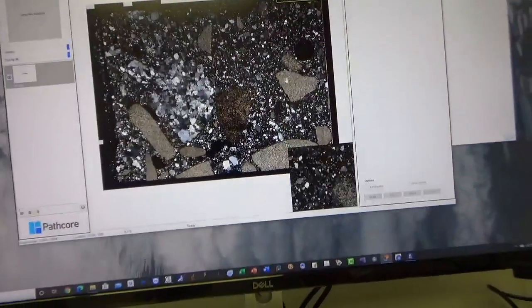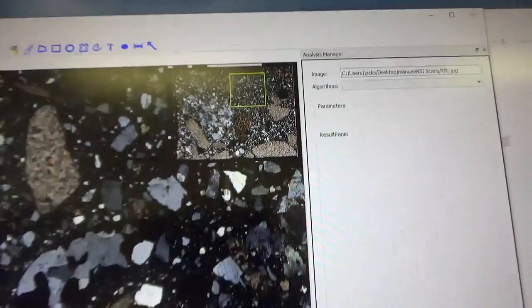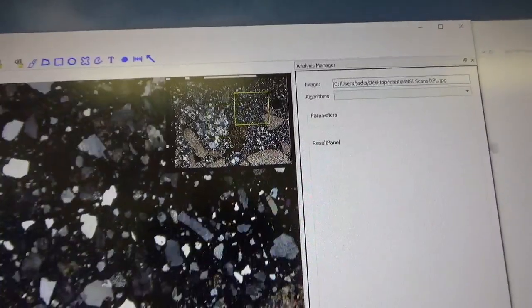Here it is. You can crop the image. Here you get a magnifying glass, and again at the top you get the entire slide. You use your mouse wheel again to go to different areas of your scanned image. Like that, and then I can crop different areas.